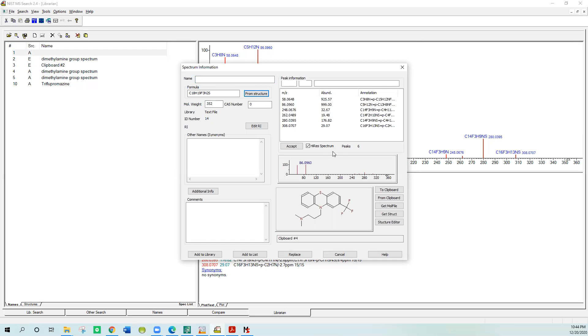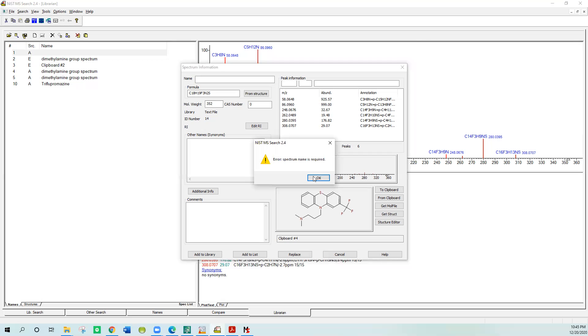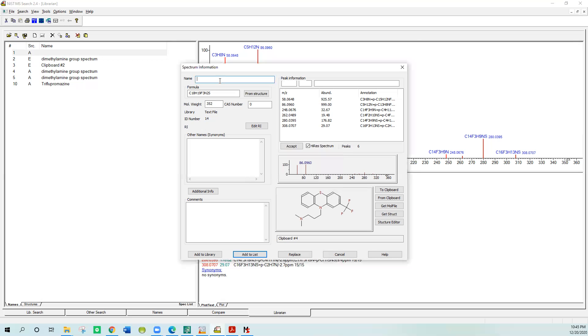At this point, if you wanted to add it to your library, you would put in some synonyms, names, put in a proper name, put in comments about where it came from, laboratory notebook number, etc., and say add to library. We'll talk about that in another session. But in this case, when we just want to use MS Interpreter, all you have to do is say add to list. It says you have to have a name, so we'll put in demo and say add to list.